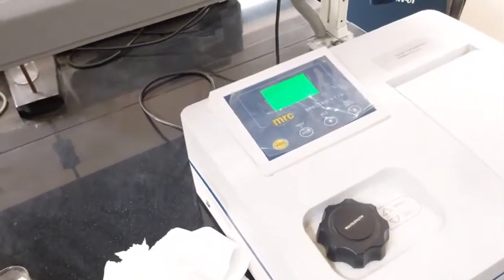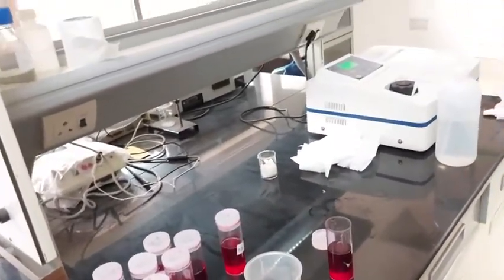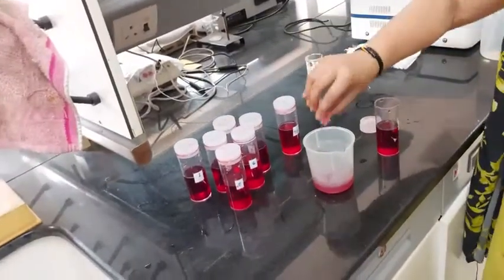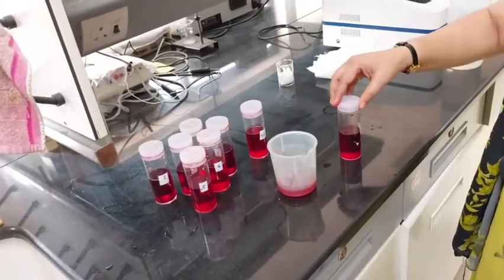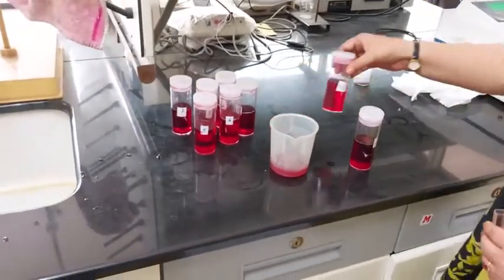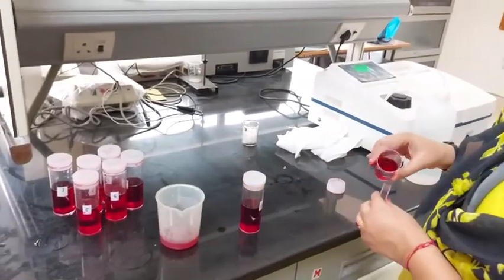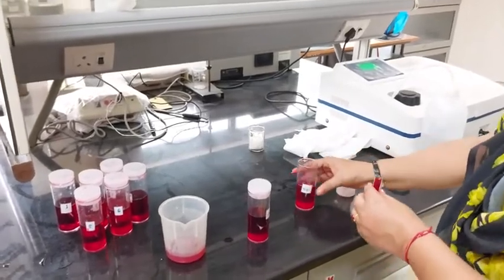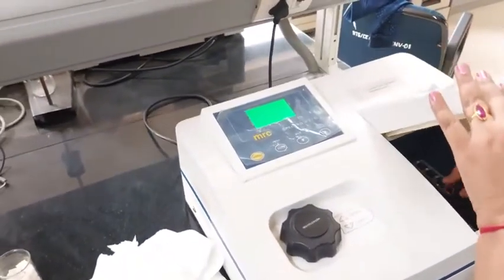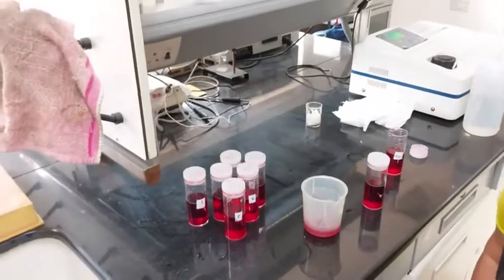For groundwater, it is coming out to be 1.030. And the last sample, which is synthetic water, is coming out to be 0.984.